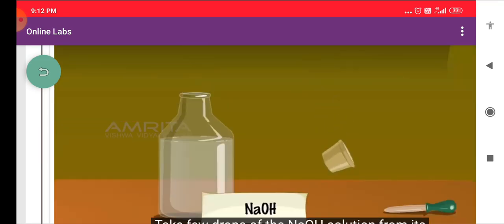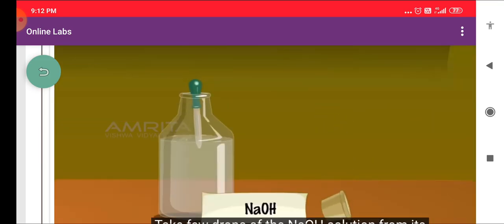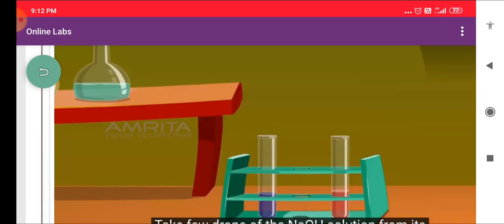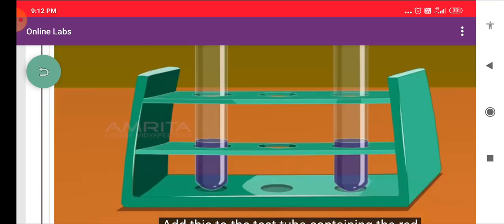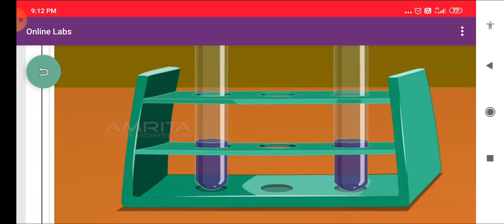Take a few drops of NaOH Solution from its bottle using the dropper. Add this to the test tube containing the Red Litmus Solution and note the change in color. The color of the solution changes from Red to Blue. NaOH is an alkali with a pH more than 7.